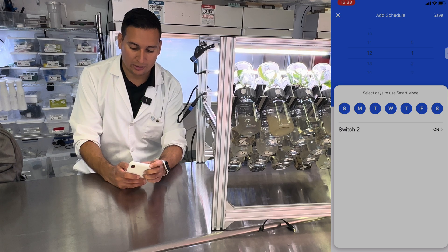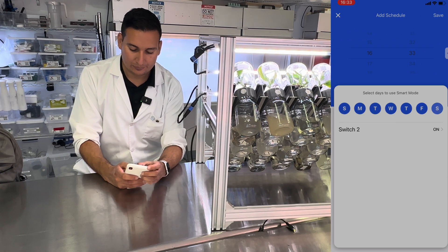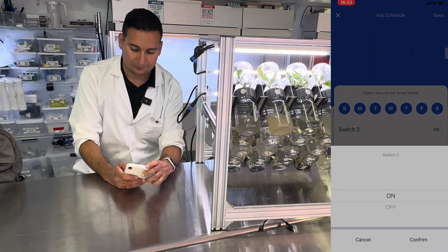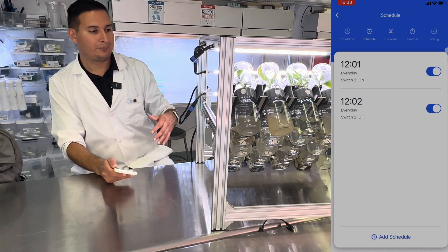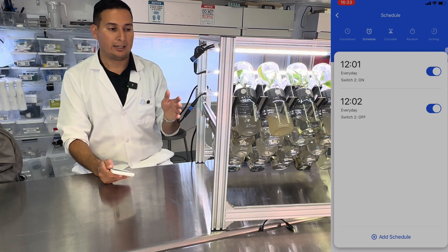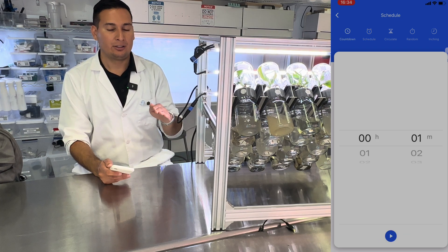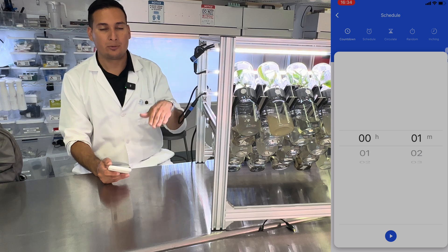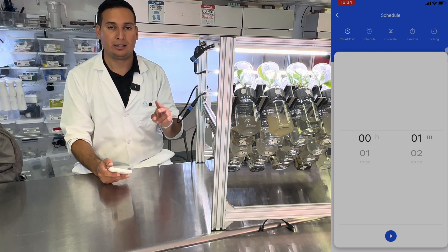I want to set switch number two to turn on at 12:01, and then to turn it off, I will set it up for 12:02 and save. That means the BioTil is going to turn on at 12 and flip one way, and then after one minute it's going to flip the other way. One switch turns the BioTil one way, and the other switch makes it return to the original position.